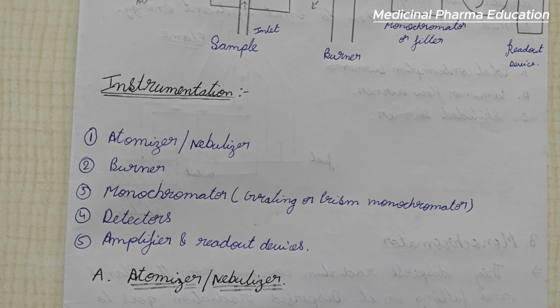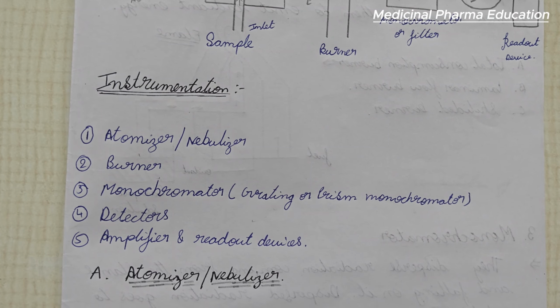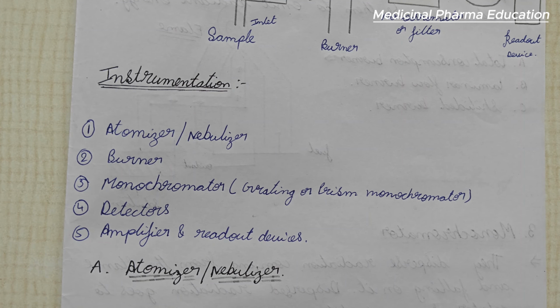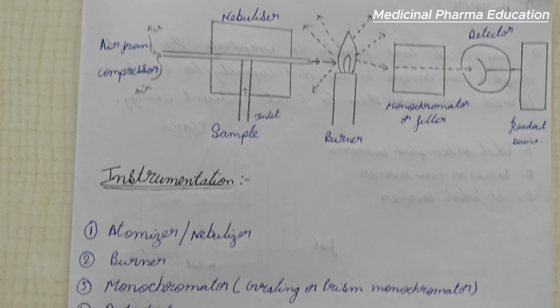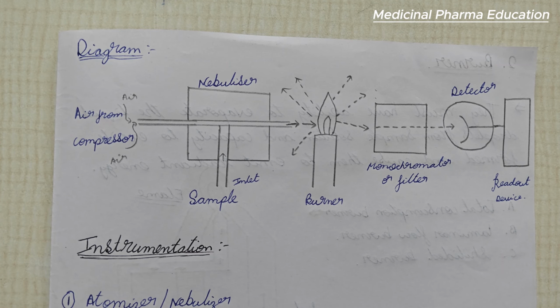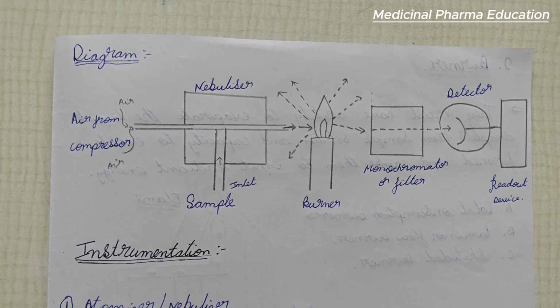If you read the UV visible spectroscopy, almost every monochromator, almost every detector, and almost every basic knowledge about the instrumentation will be cleared. So I now also recommend you to complete the UV visible spectroscopy first. And then amplifier and recorder. Okay, I'll just explain the instrumentation, so you'll understand the mechanism involved in flame emission spectroscopy.